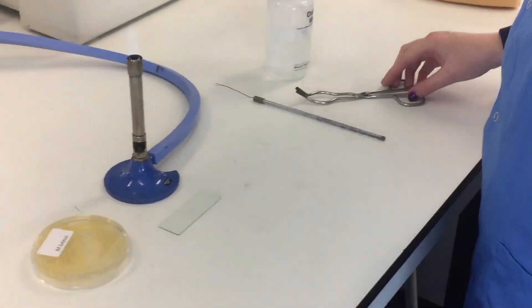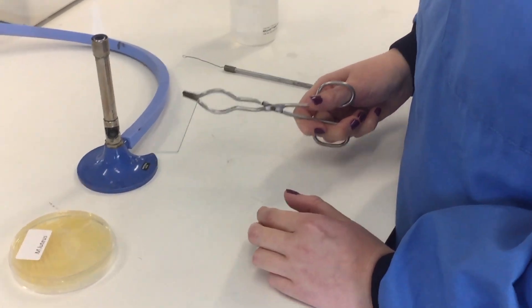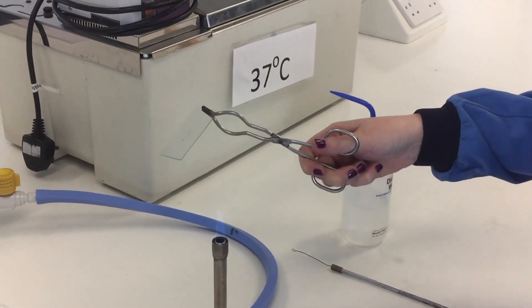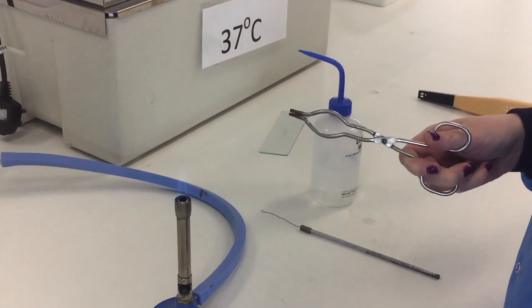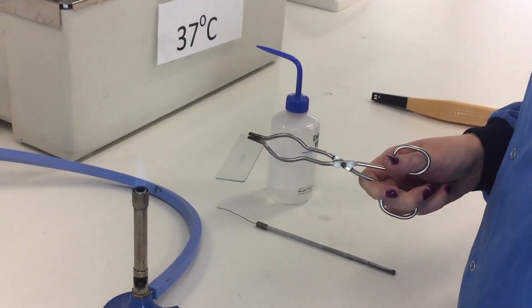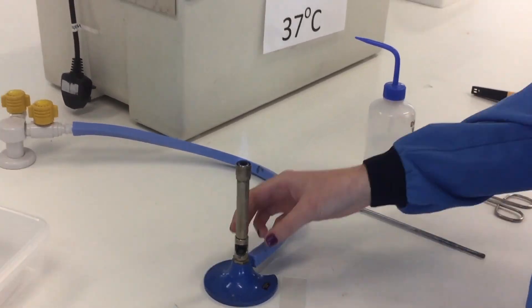Then you will grab the metal tongs and use them to hold a single edge of the glass slide. With the slide tilted slightly, you will apply heat to the bottom of the slide — just a few quick passes through the blue cone of heat should do it. Check the back of the slide for heat; the slide should not be hot enough to burn your hand. Do that with care. Once this has been completed, the sample is dead and it is now heat fixed to the slide. You can put the slide down onto the surface, turn off the flame, and we can begin the staining procedure.